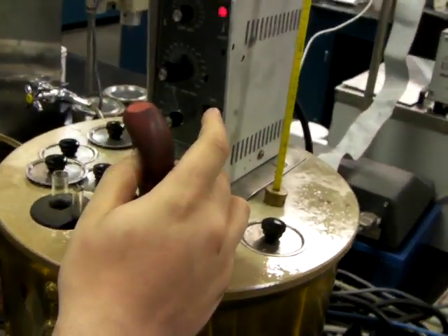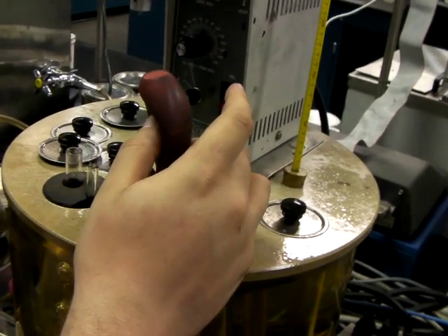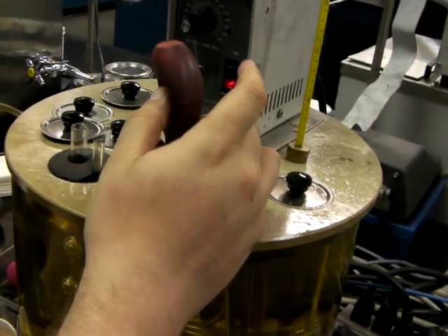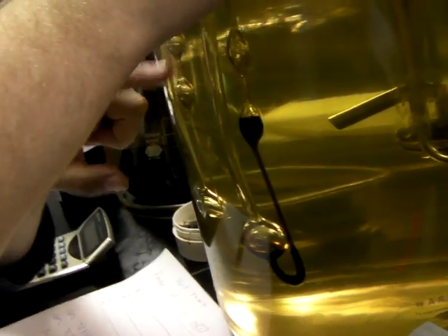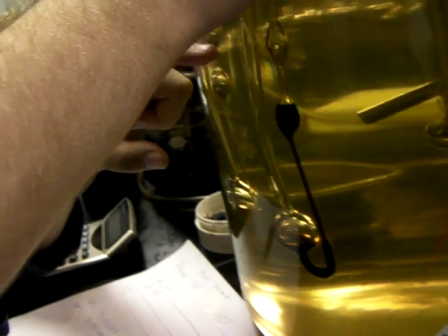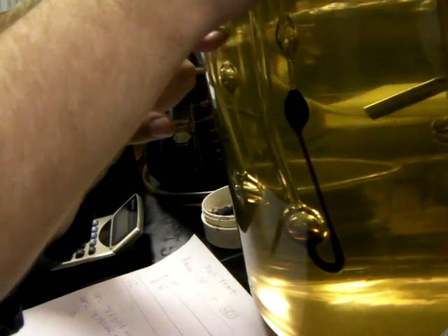So what we're doing here is we're siphoning up all the oil until it's above this line here. I don't know if you can see it, but you want it well above the line and then you let it flow.